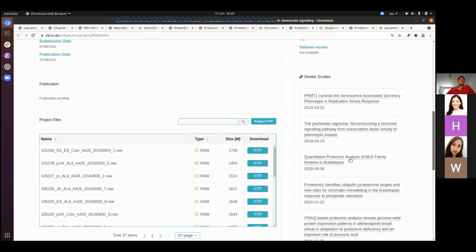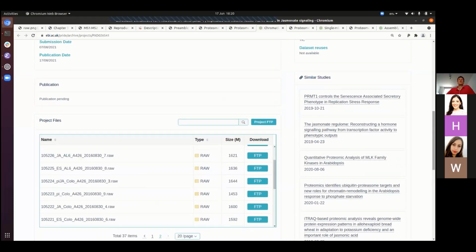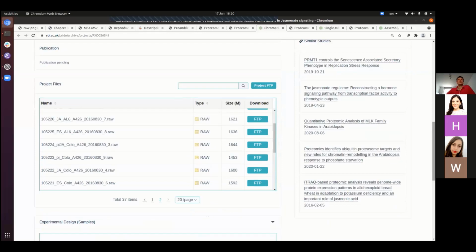So ideally, one of these files would be a file that describes the experimental design. And that's the file we could then download. If it's a CSV file, for example, that describes all the samples, called metadata or sample description, then we could download it with RPX exactly how I did before.